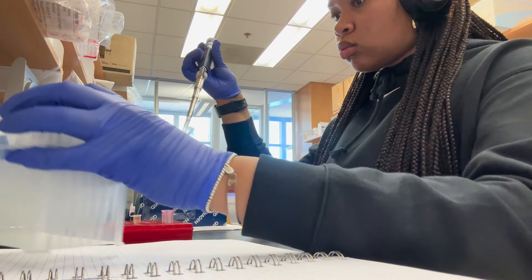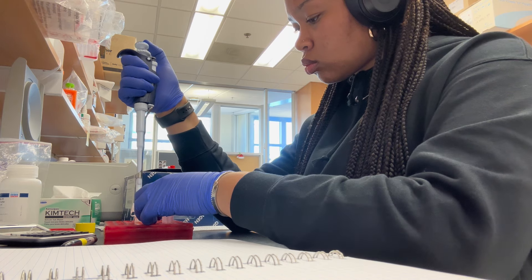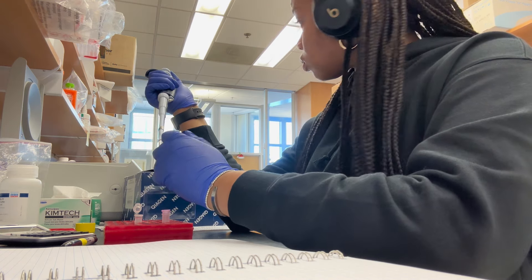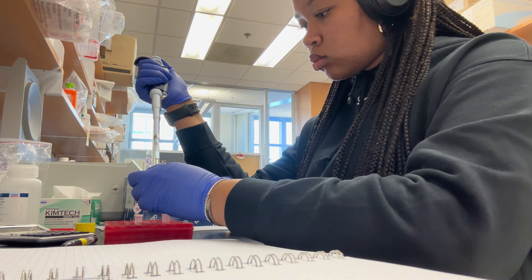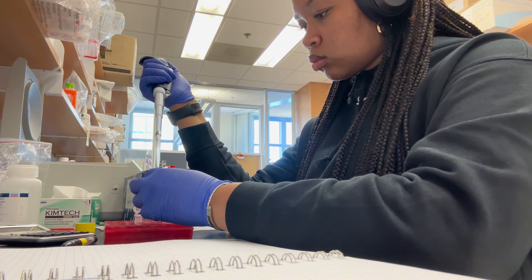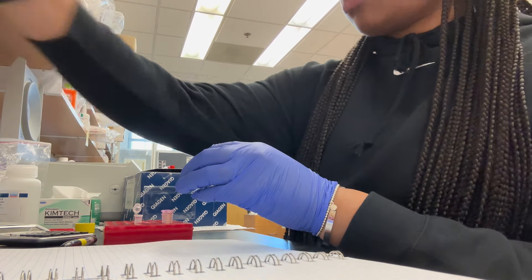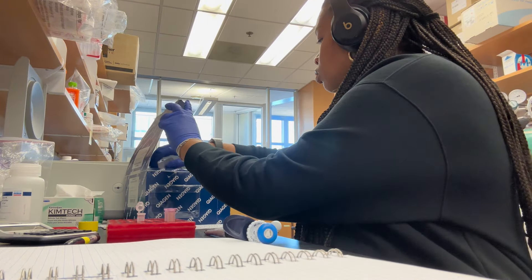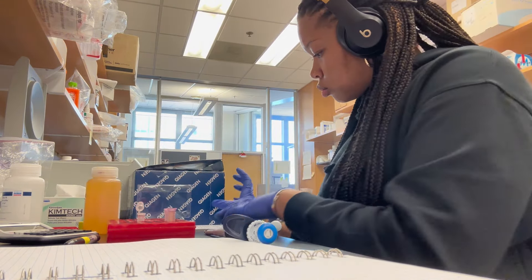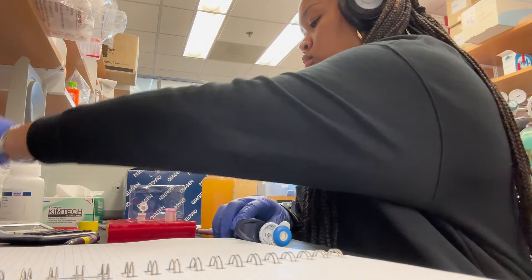This is a really easy process — this is just one of my experiments for the day. All you do is you use this kit and you basically dissolve the gel to get whatever is in there out. I'm just adding this stuff, and I can't tell you what it is off the top of my head, but it's used to help dissolve the gel. That orange stuff — it's just used to dissolve the gel.